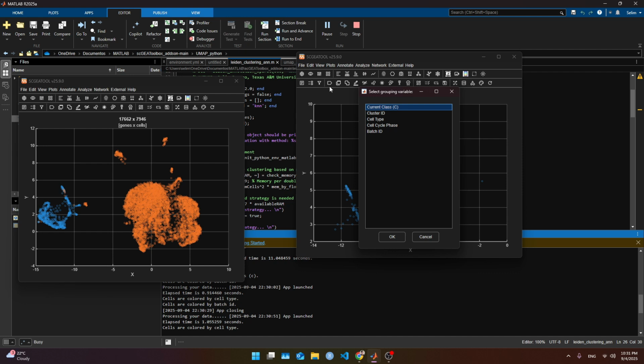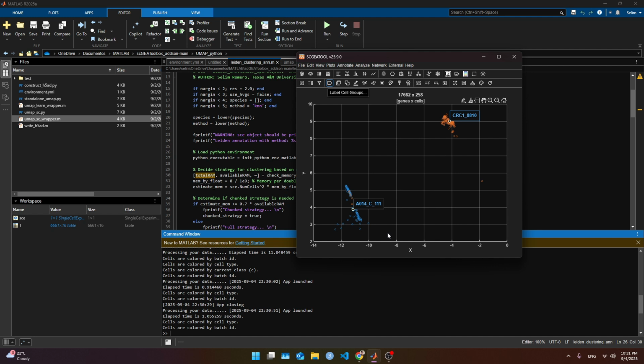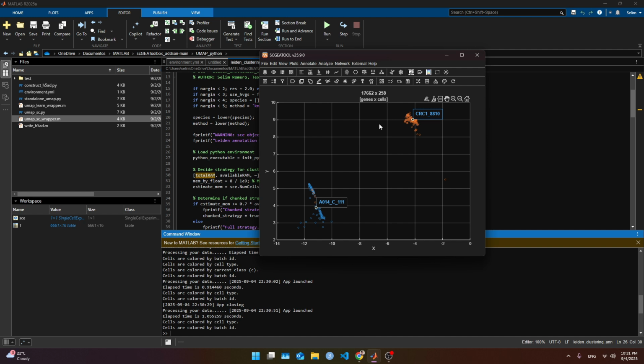Now, this is part of the downstream analysis. We have the same cell type classification. Still, we need to verify that this is truly fibroblast by verifying the expressions. But right now we are just going to proceed, and we'll work later on how to verify the integrity of the cell classification. In this case, we're going to do some downstream analysis.